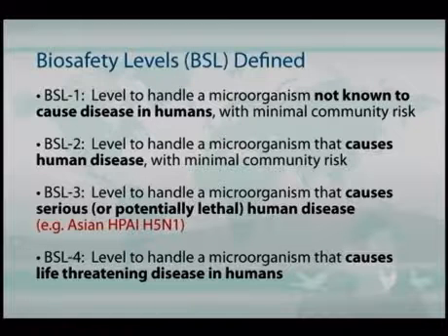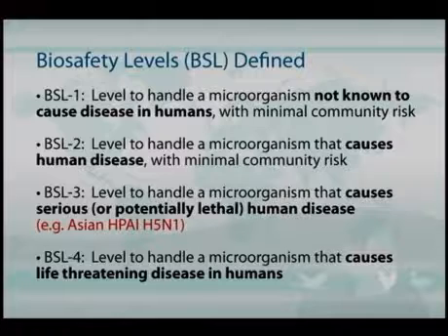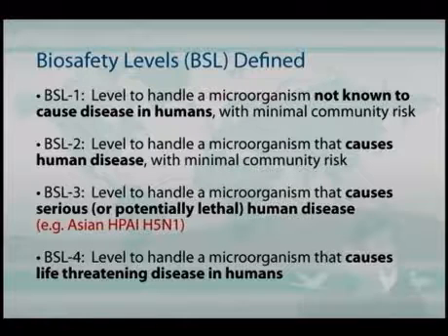Those microorganisms that should be worked in BSL-2 conditions or environments are those that can cause human disease, but again with minimal community risks. And many of the university laboratories would be of the BSL-2 variety.